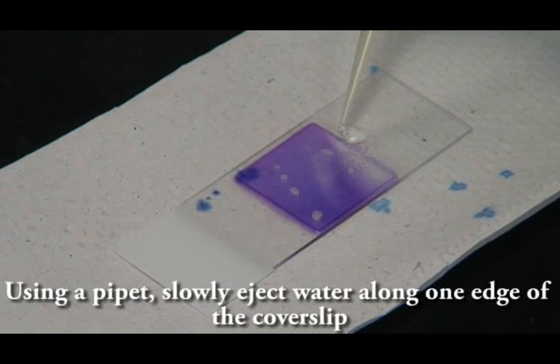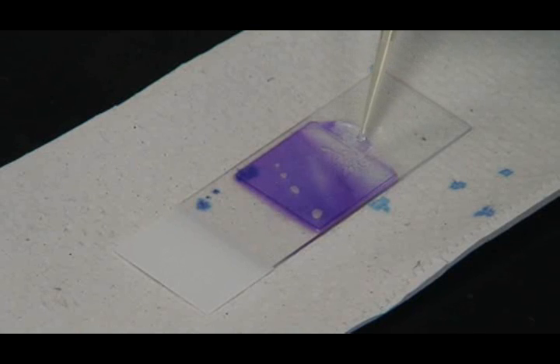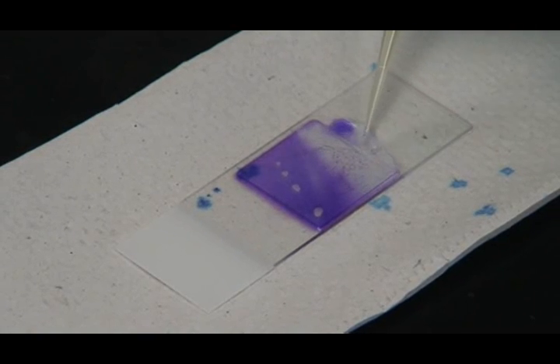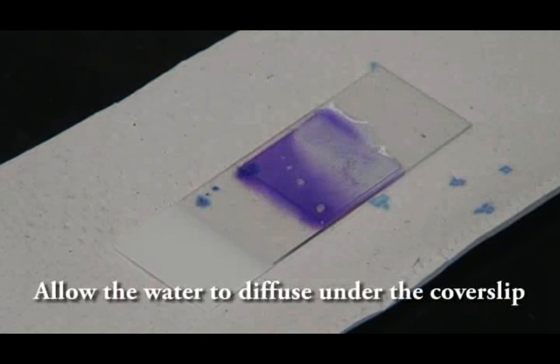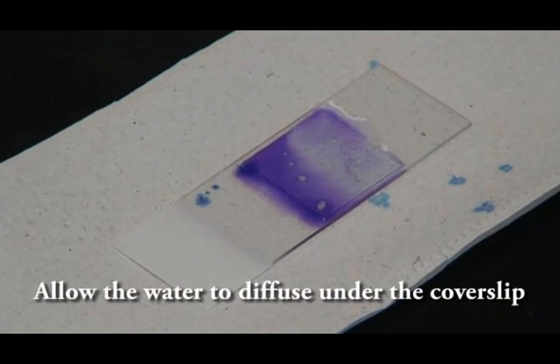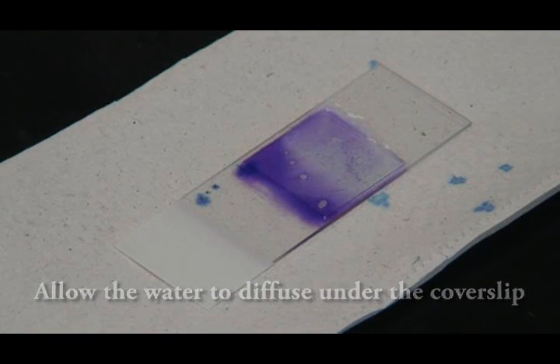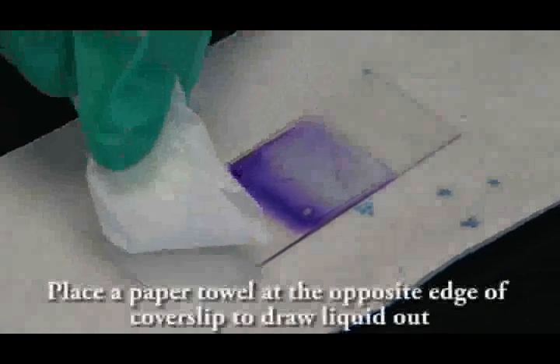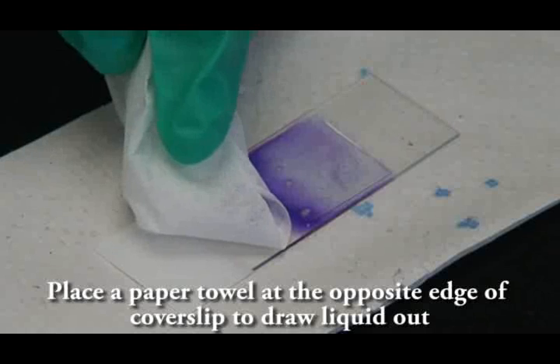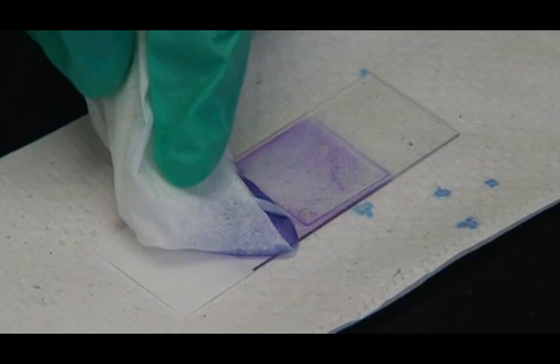If the stain does not readily diffuse under the cover slip, take a few drops of water to one side of the cover slip and then draw the fluid under by touching a dry paper towel or Kim wipe to the opposite side of the cover slip.